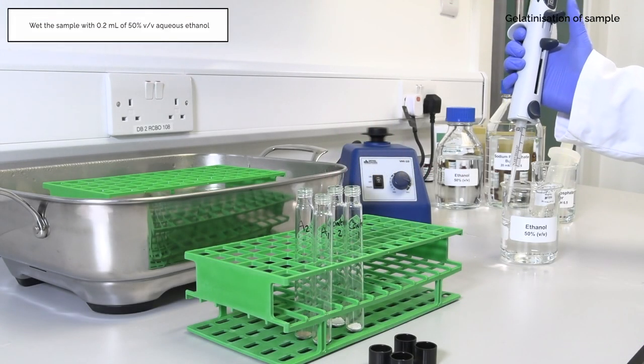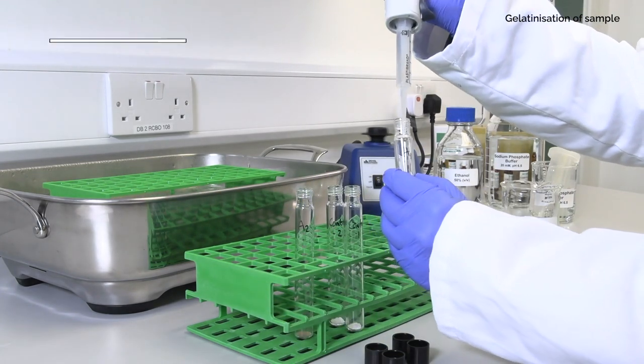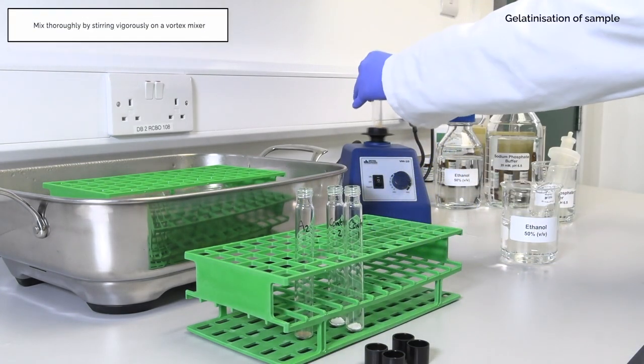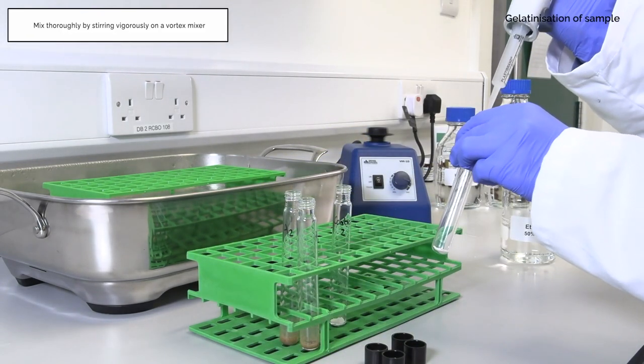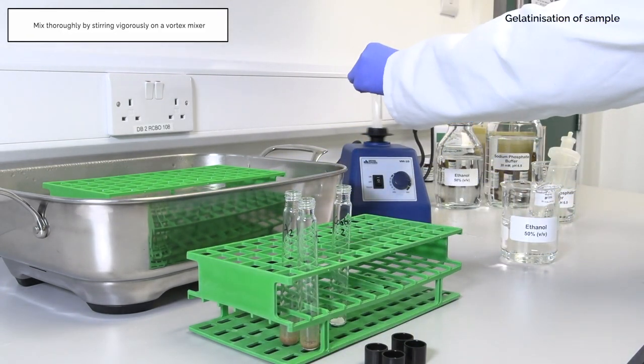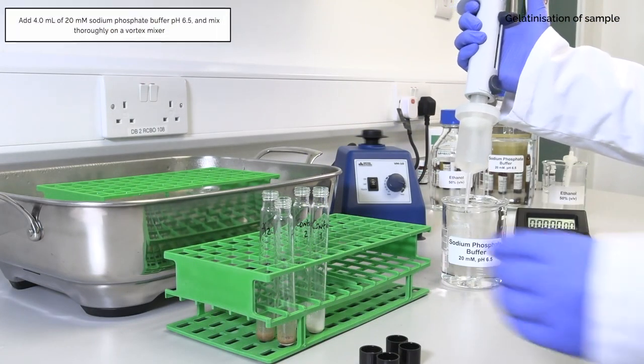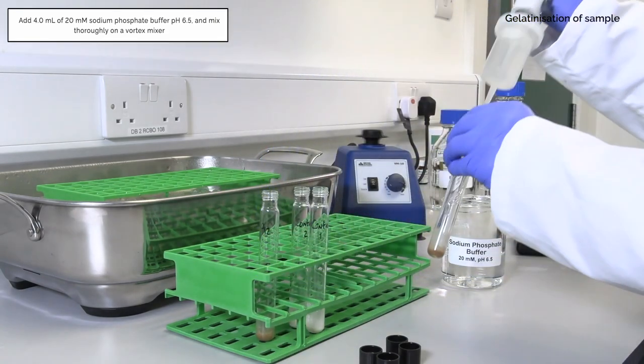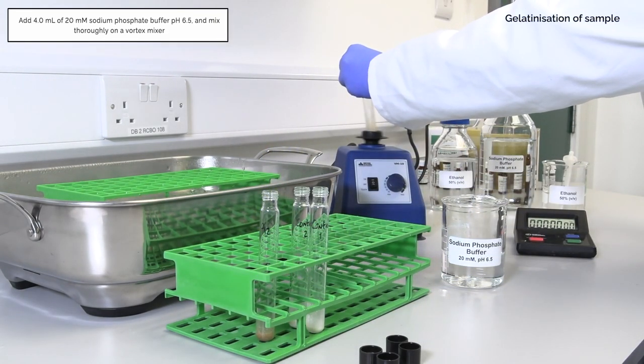Wet the sample with 0.2 milliliters of 50% volume per volume aqueous ethanol. Mix thoroughly by stirring vigorously on a vortex mixer. Add 4 milliliters of 20 millimolar sodium phosphate buffer pH 6.5 and mix thoroughly on a vortex mixer.